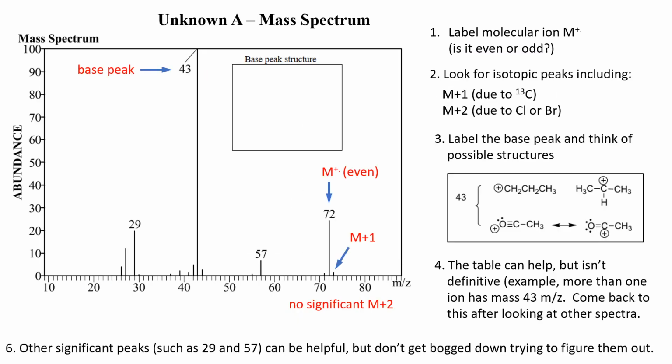Now we can return to the mass spectrum and address what is that base peak that we were looking for. We said that there were three possibilities for this peak, three different kinds of fragments that could weigh 43. There's a normal propyl group, an isopropyl group, and this acylium ion. The acylium ion is a really good choice because this acylium ion that weighs 43 comes from a methyl ketone. So now we can assign the base peak structure definitively. One last piece of advice is when you have a structure that you think is right, make sure you go back and double check and make sure that it's consistent with all your spectra data. Sometimes you can get something that's a pretty good fit but doesn't quite work. In those cases, you should revise your structure and find something that fits with everything.